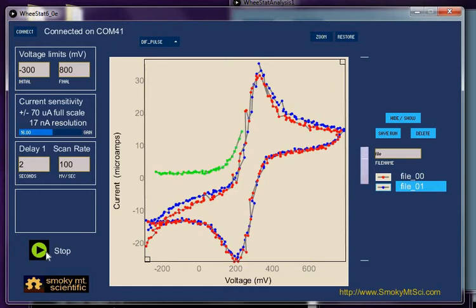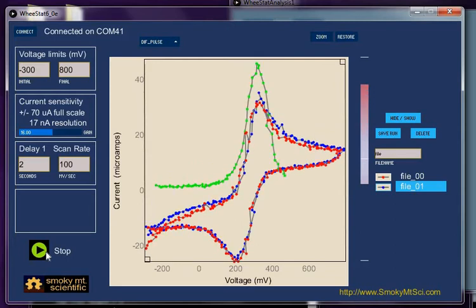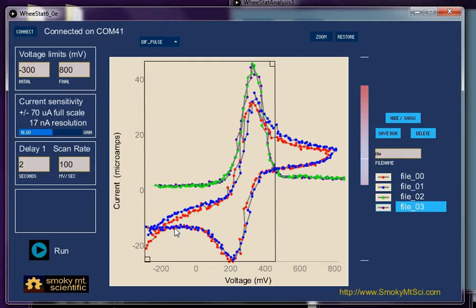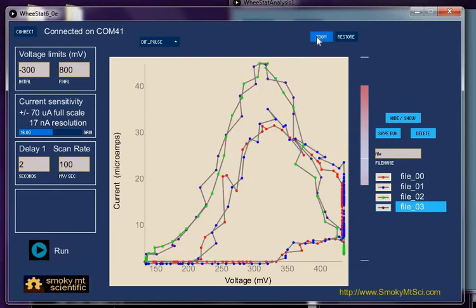All right so here comes a differential pulse experiment. We'll run that again just so we have two of each. Once this data acquires I want to show you that we have a zoom feature. If you have a specific part of your voltammogram that you're interested in looking at you can grab this little box up here in the corner and drag that over and when you hit this zoom it zooms in on that part of the data.